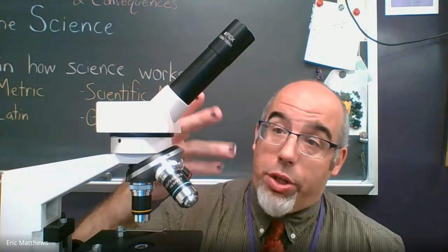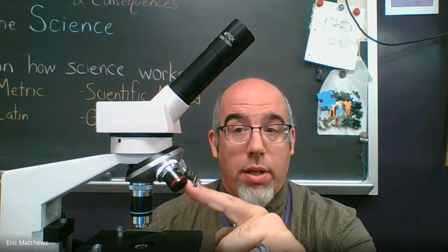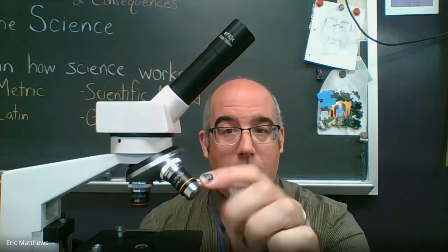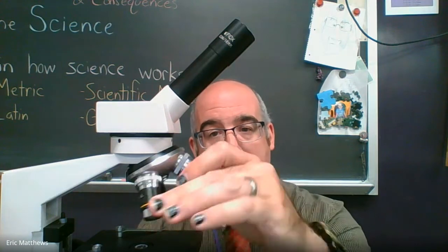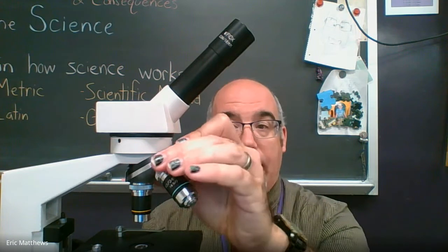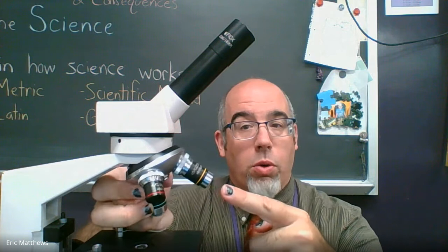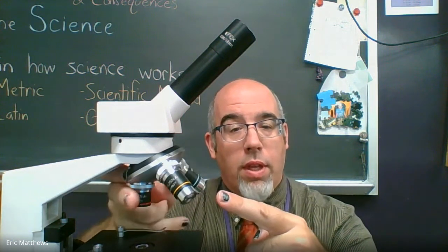And here we are. So what I'm going to do now is show you a little bit on the microscope, and I'm going to show you how to make a cheek mount so that you can actually see your own cells in the microscope. You're going to do that under low power, which is this red one, medium power, which has the yellow, and high power, which has the blue. You can also tell by the size of each one which one is the weakest, which one is in the middle, and which one is the strongest.